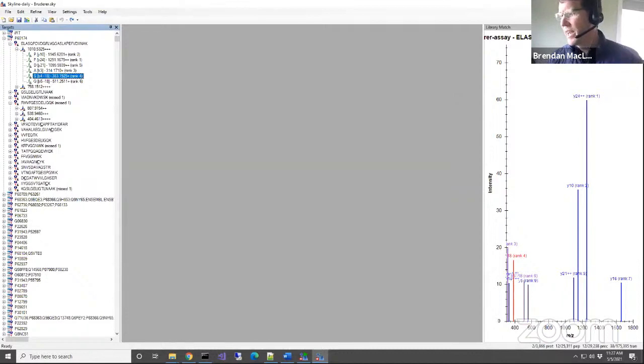Can Skyline recognize .tsv spectral library from DIA-NN? I'm not sure. I think that question was asked yesterday. Try it, and if it doesn't work, just pop up on the support board and say, I really want to use the spectral library from DIA-NN, and supply one. Here's the TSV, and I guarantee you that we'll have it implemented relatively quickly, probably no more than a few weeks.